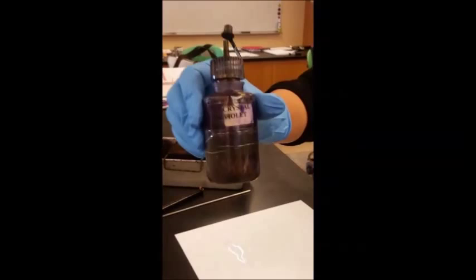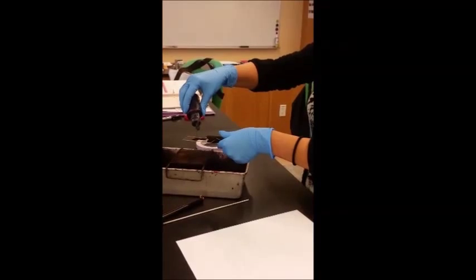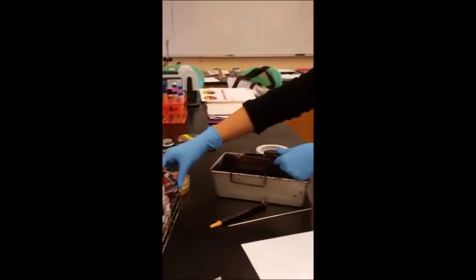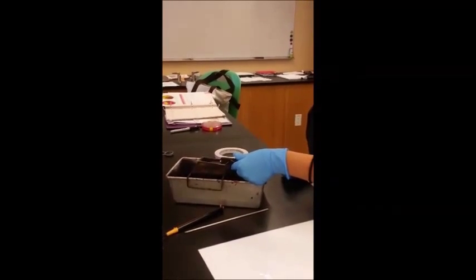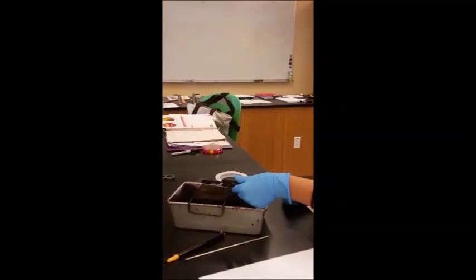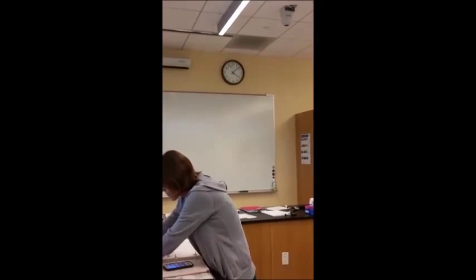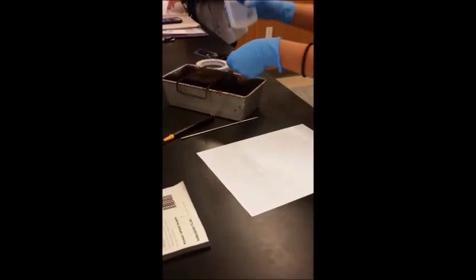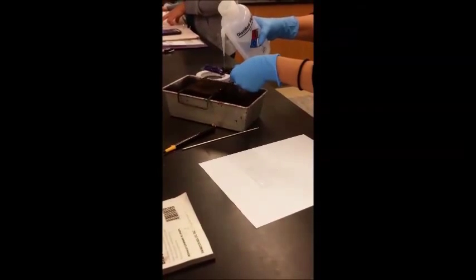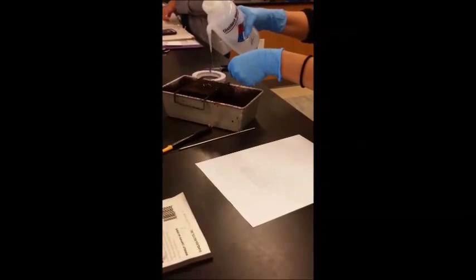The first dye we use is the crystal violet. We just add a few drops of it onto the slide. Now we let it sit for just 1 minute, not more, and not less. After a minute, we will wash off the slide. We'll wash off all the dye from the slide. Just to make the slide clear, we try to wash both sides of the slide. We want to make sure we take the dye off.